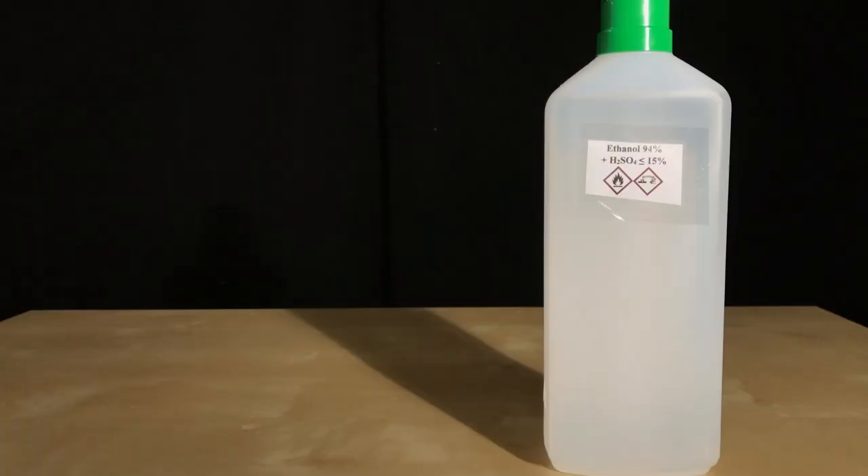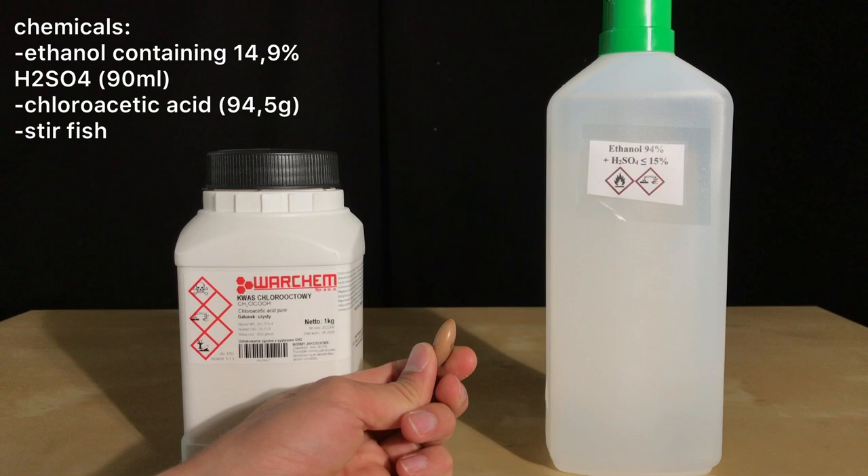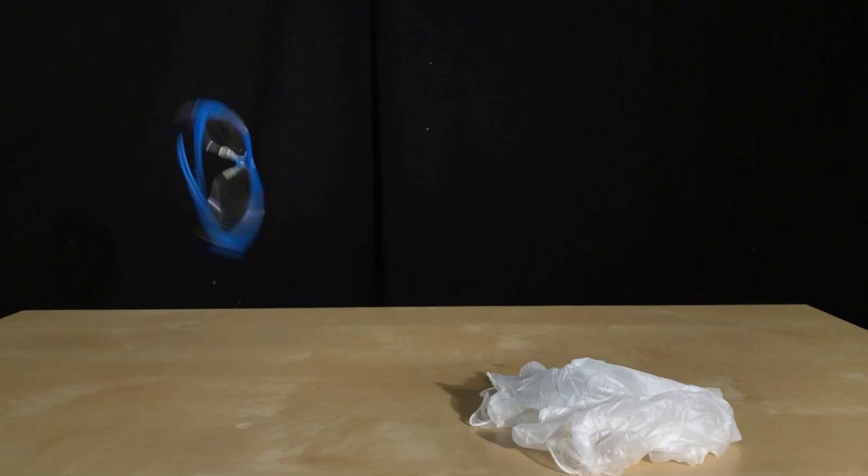My ethanol already contains 14.9% sulfuric acid, so we don't have to get into that. 90ml, which represents an excess of this ethanol, were used. Besides that, 94.5g of chloroacetic acid and a stir bar will be used. Safety gloves and safety goggles will be worn.